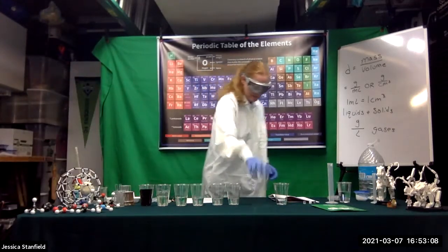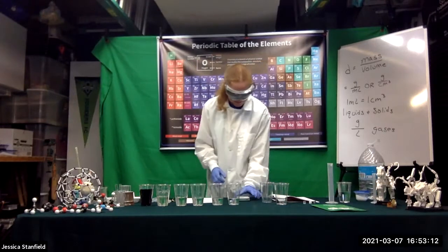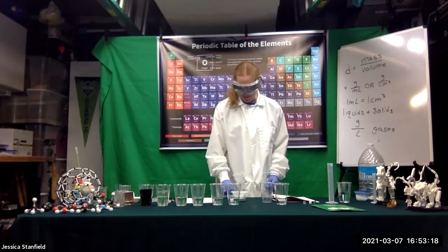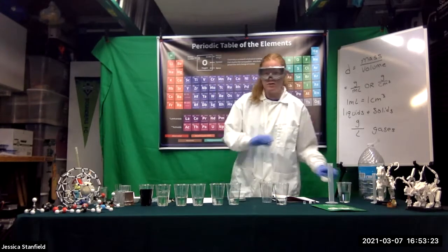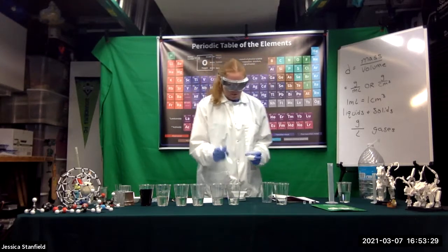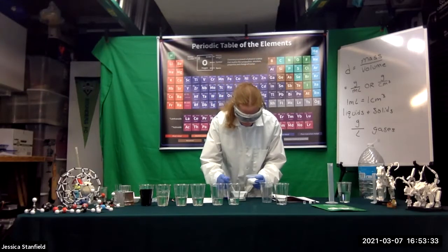So I did not make my 10% solution yet. I'm going to do that as a demo with you guys. So I'm going to get my balance out. I'm going to turn it on. I'm going to get a weigh boat. I'll put the weigh boat down, and then I'm going to hit the tare button. That's going to cause my balance to read 0. So now all I have to do is add my sugar to my weigh boat and watch what my balance says, and that'll tell me how much sugar I have.